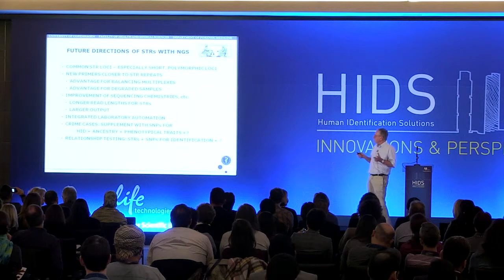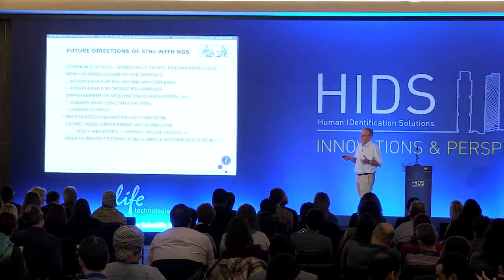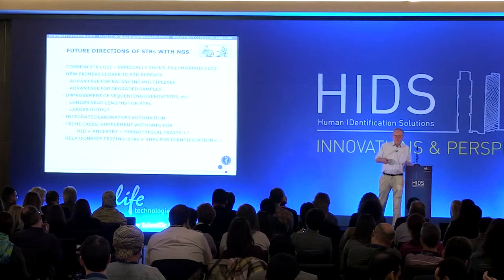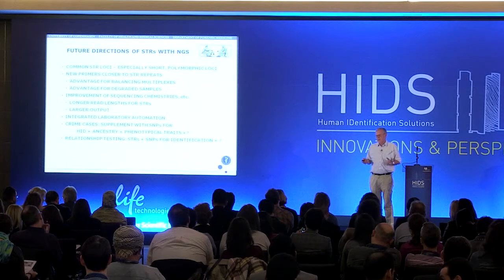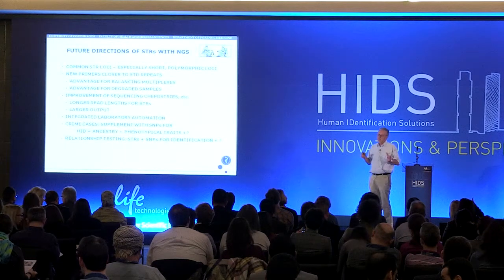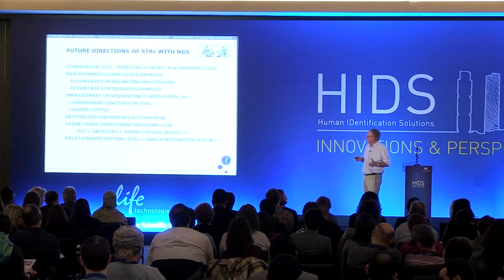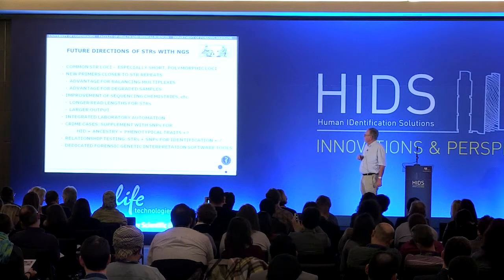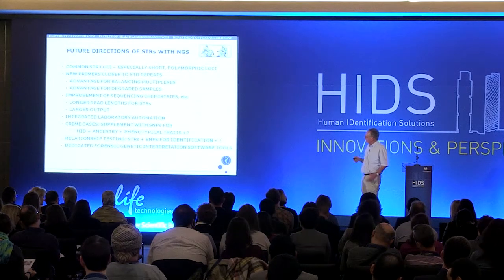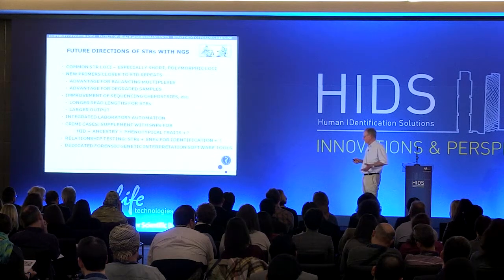And the first thing that we will use it for is most likely the difficult paternity cases and relationship testing. And we are actually implementing as good as we can these methods with some of these kits. And again, software tools that are useful.